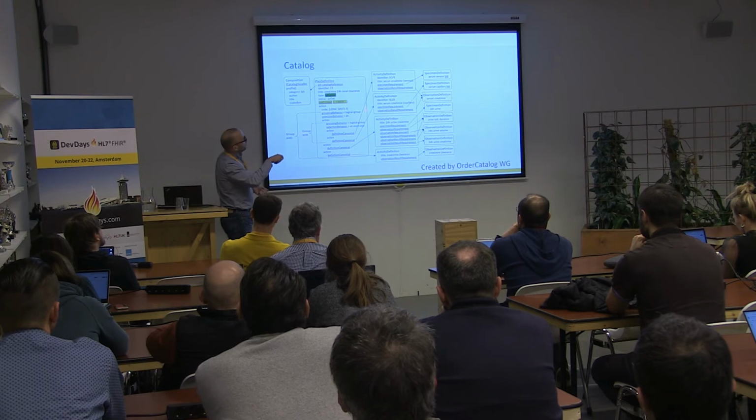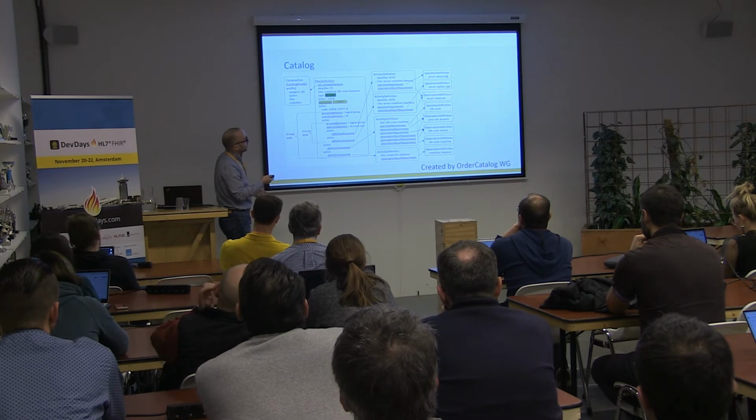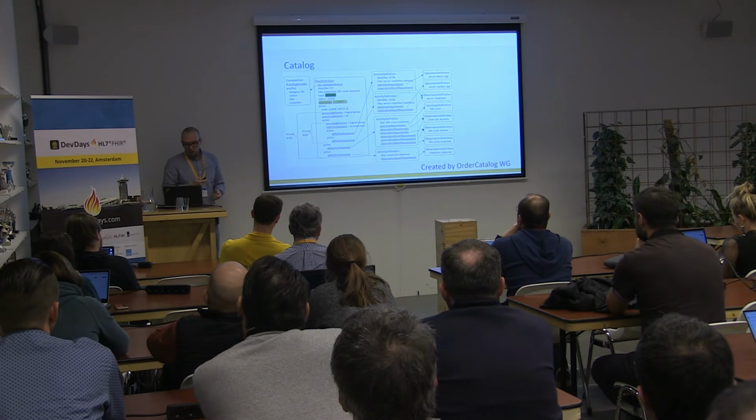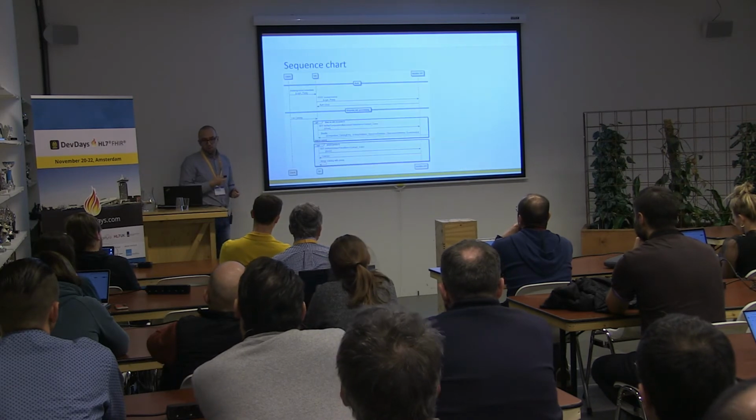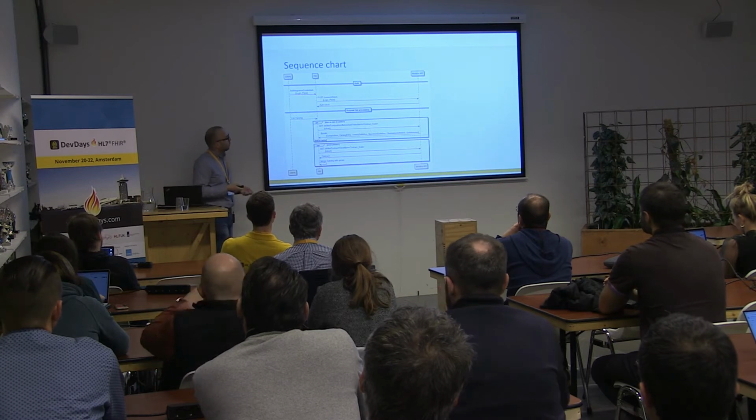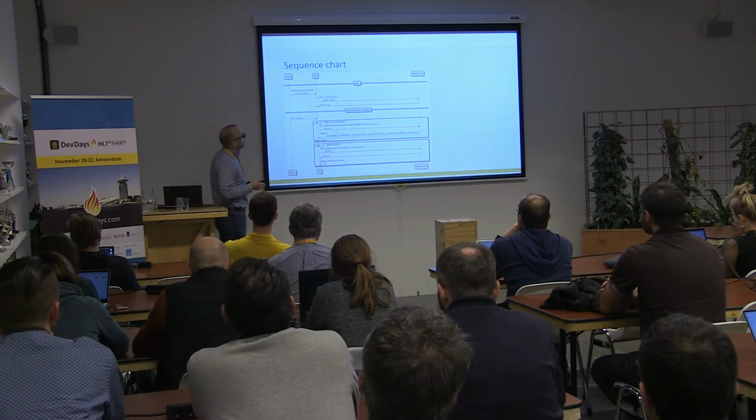Also, all activity definitions have links to specimen definitions if they are required, and information about observations which will be reported. So, okay, we have seen how these can be encoded, but how can customers receive this information?